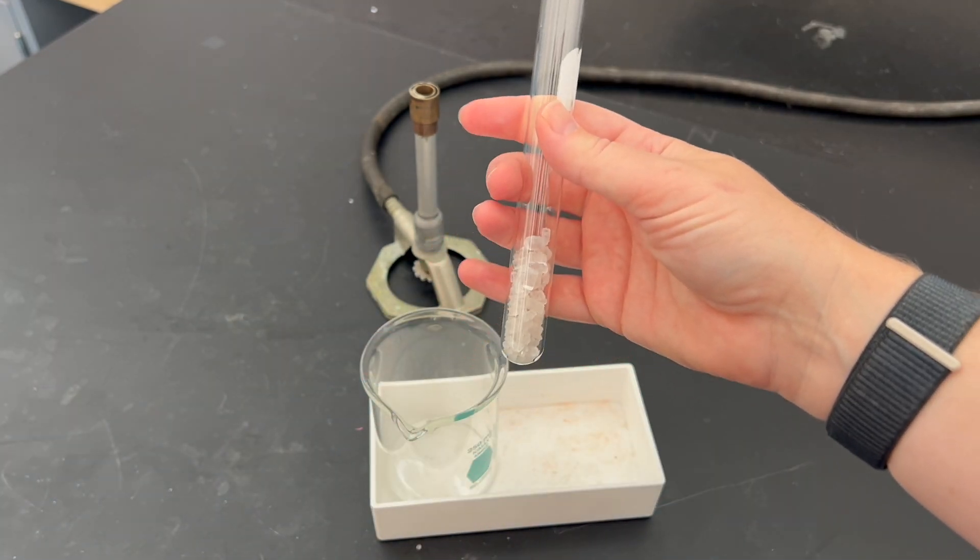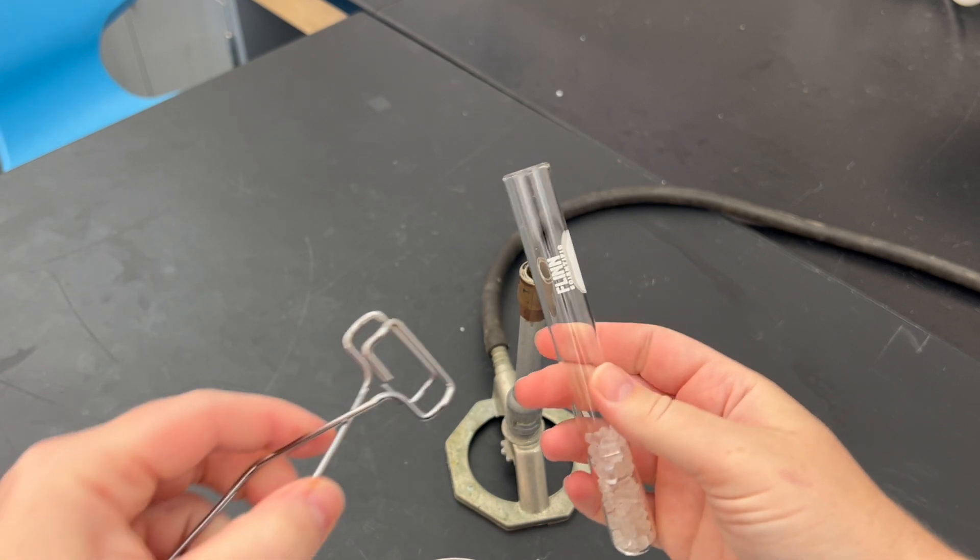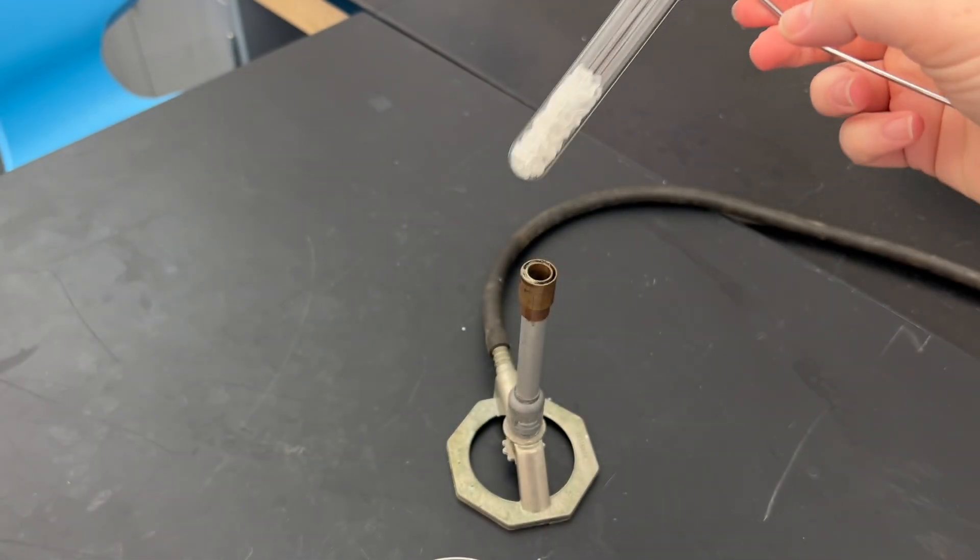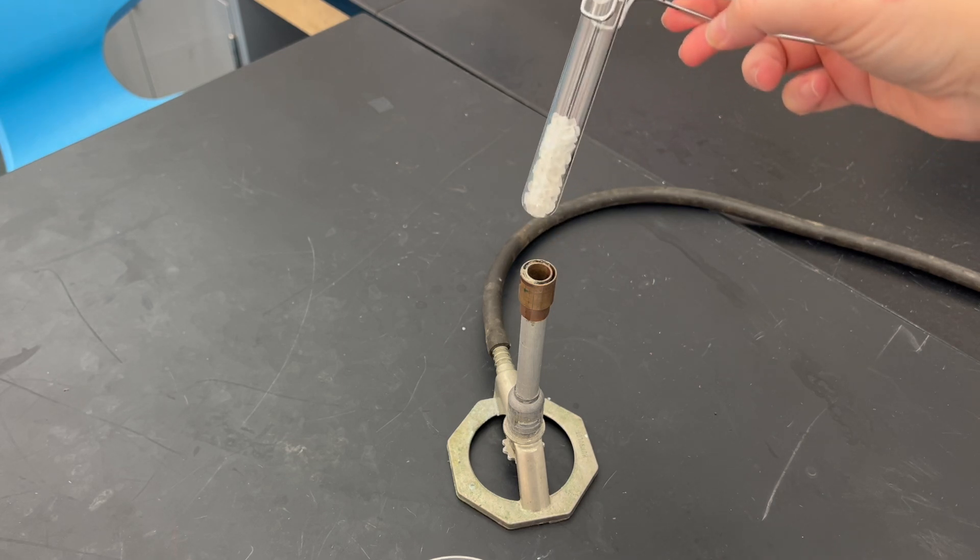Now you're going to heat this with the Bunsen burner. Using your test tube clamps, clamp it and make sure it's secure. Point this away from any person and heat it up until it's melted. Then you'll put it into your beaker to cool on the lab bench.